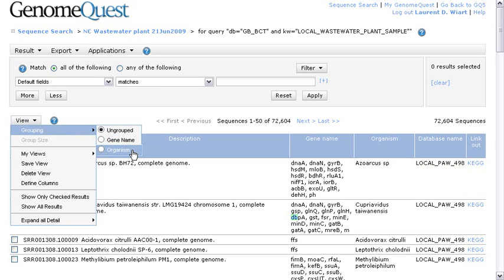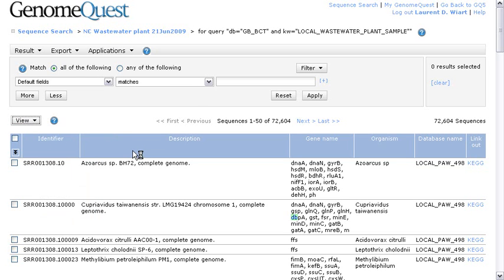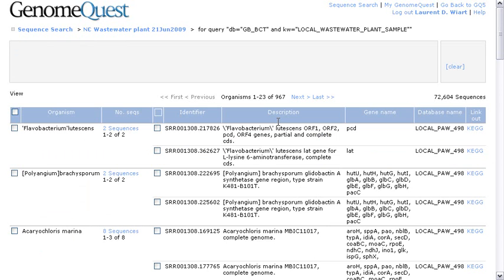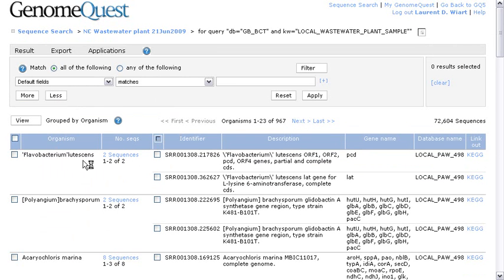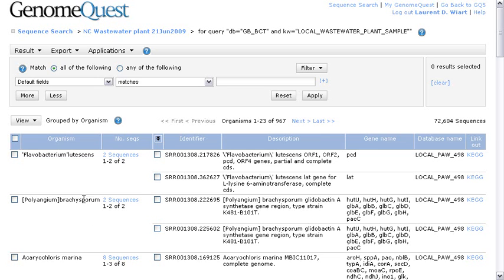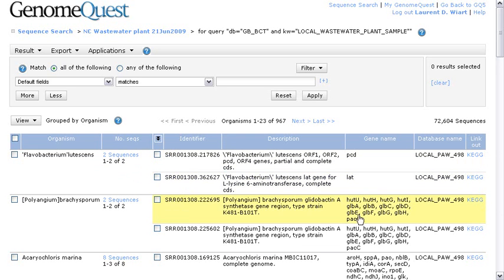Choose organism for the grouping. Now, those 72,000 reads annotated by GenBank BCT division are regrouped by organism. You see the first column is now organism. And for each, we know how many reads were annotated by sequences from this organism as well as the gene name if available and other information.